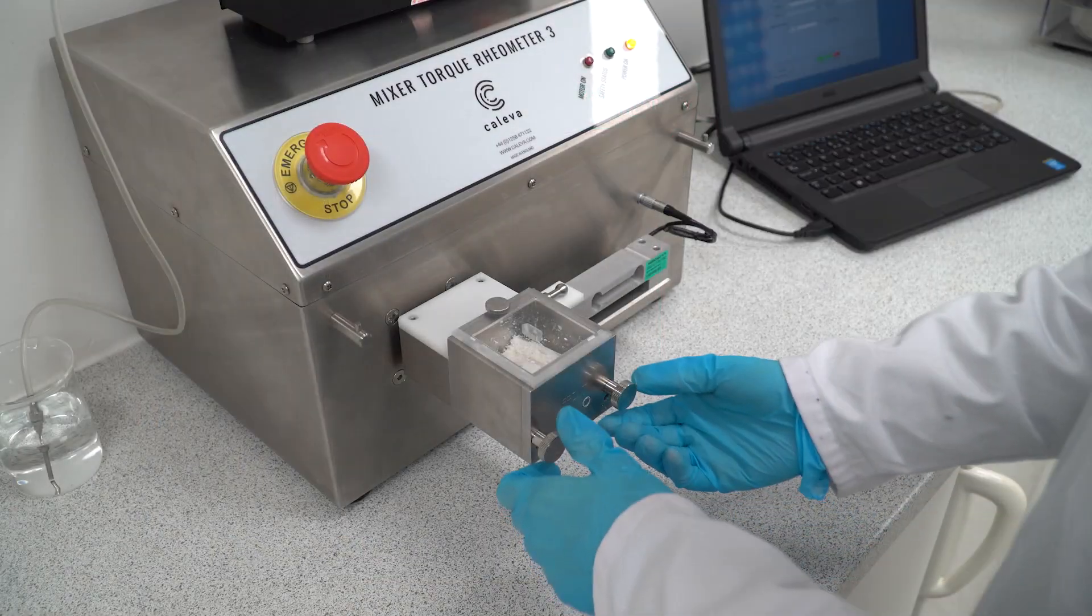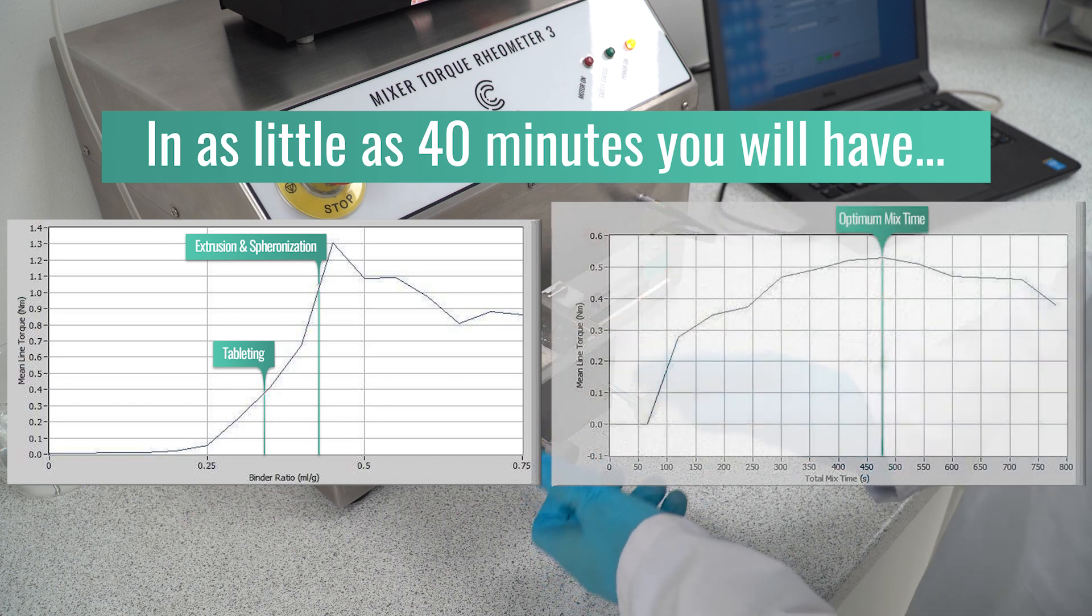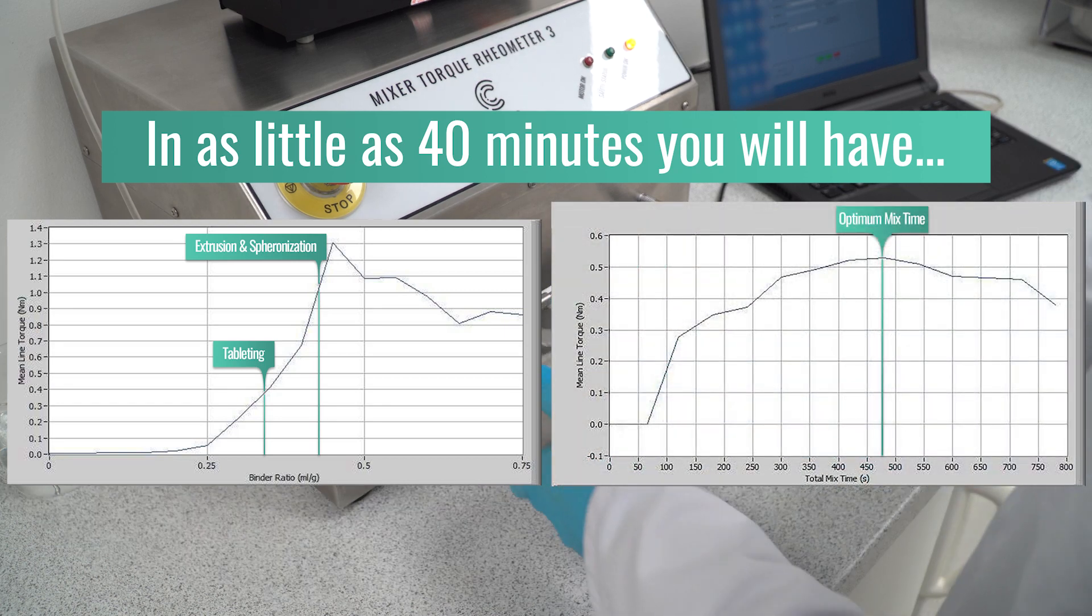These two tests produce repeatable results quickly, allowing you to determine both the optimum binder ratio and mixing time for your formulation in as little as 40 minutes.